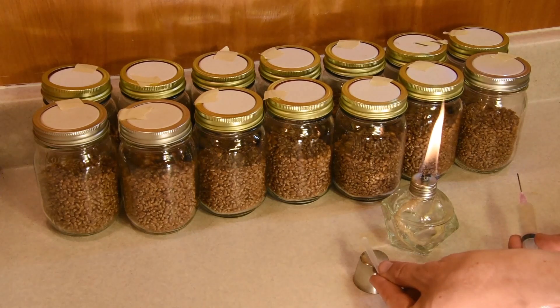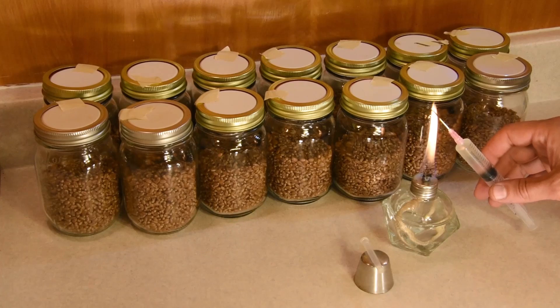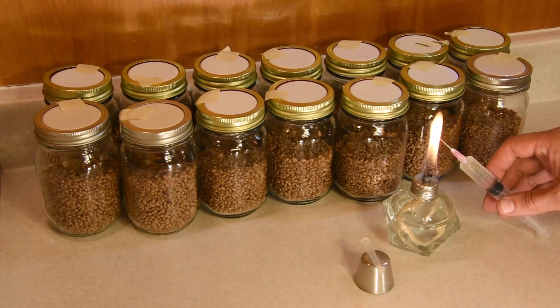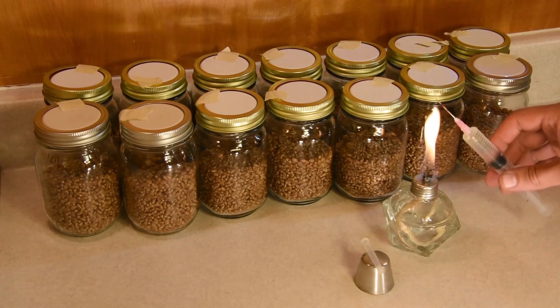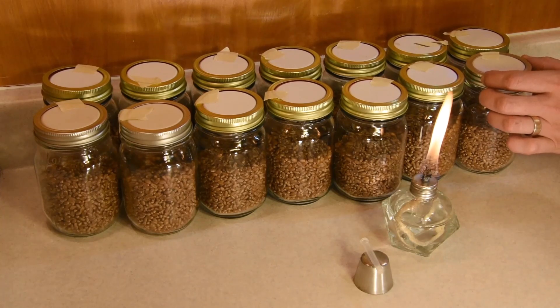I'll take my needle and set the cap down on a little stand to make sure it stays clean. I'm going to flame the needle until it's red hot, angling it 45 degrees up so that the air can escape out rather than be pushed in. And now I'm pretty much ready to go.